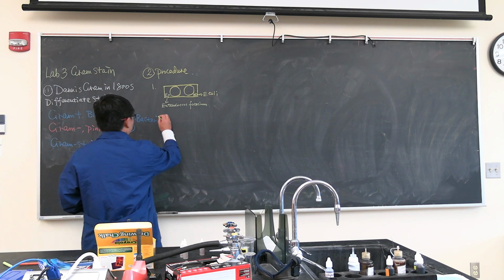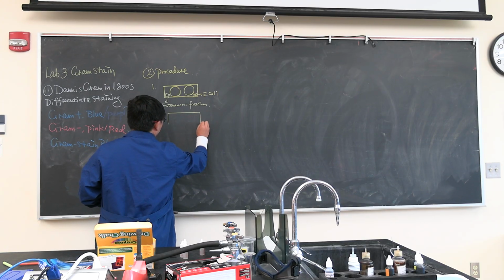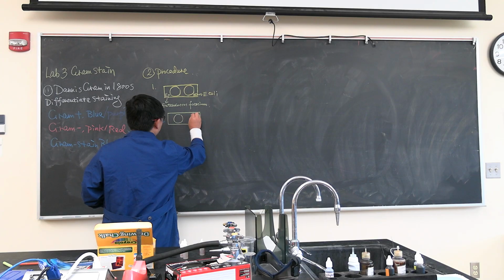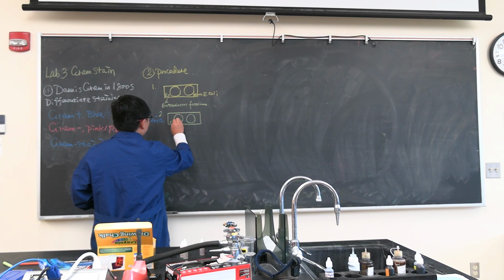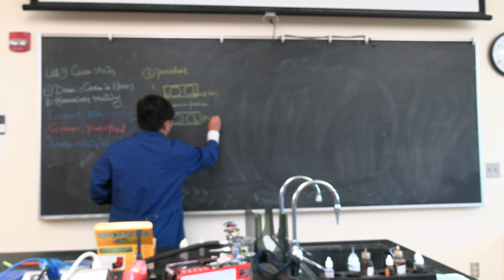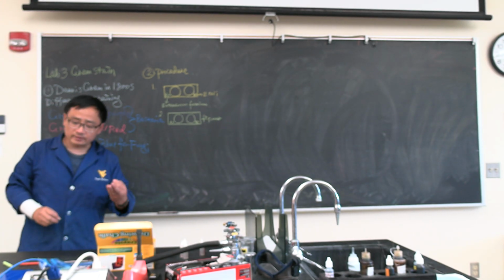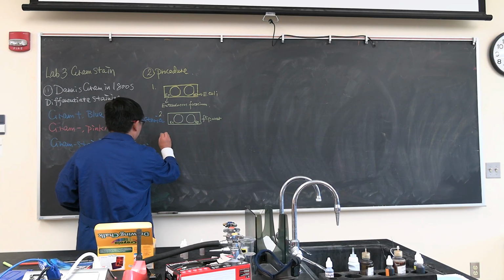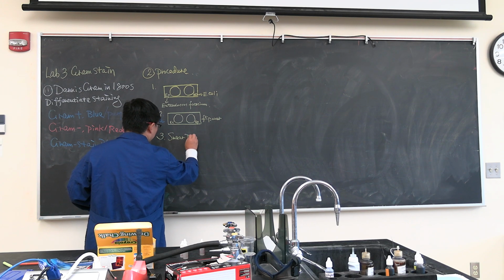So first of all, label. Then second step, same thing. You flip it over. Okay, so you flip them over. When you flip it over, it may become EC, EF. So we say flip over because we mentioned the Sharpie marker dye could damage the objective lens. So we flip it over. Then we'll move on to the step we call smear preparation.